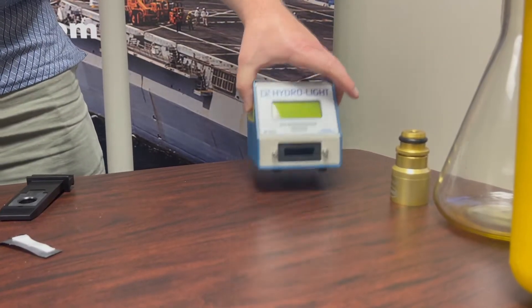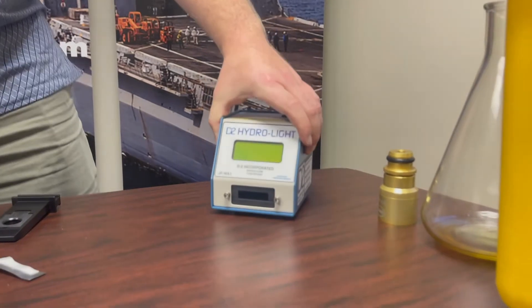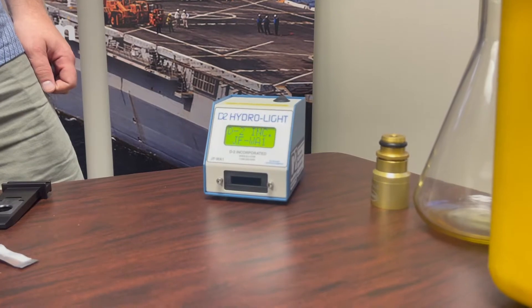This is the D2 Hydrolite Digital Free Water Detector. As you can see, it's plugged in. Simply flip the switch to turn it on, at which point you'll see the screen illuminate.